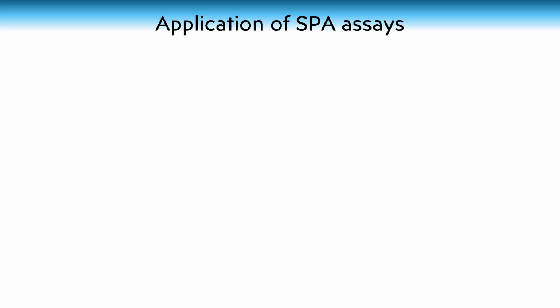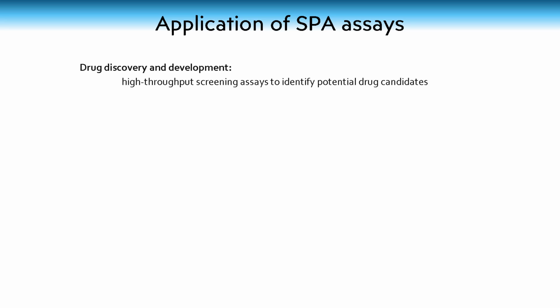Scintillation proximity assays are relatively quick and cheap to perform, so they are widely used in high-throughput screening to identify potential new drugs. The assay is helpful for characterizing the pharmacology of receptors. In addition to measuring affinity, the kinetics of binding can be investigated by incubating radioligands with receptor-linked microbeads for varying times and measuring how rapidly an equilibrium is reached.